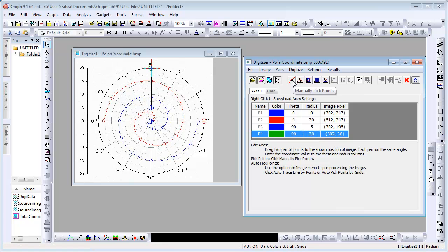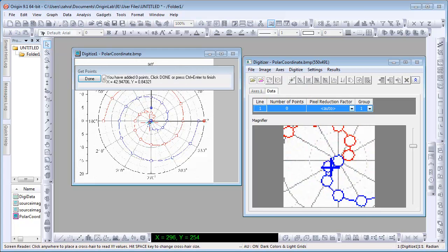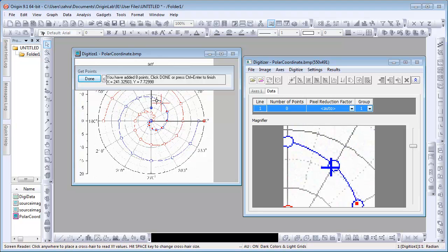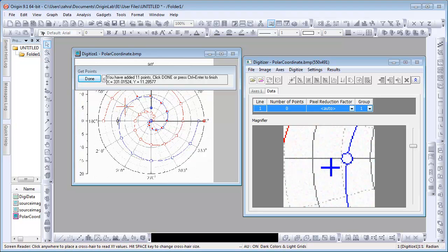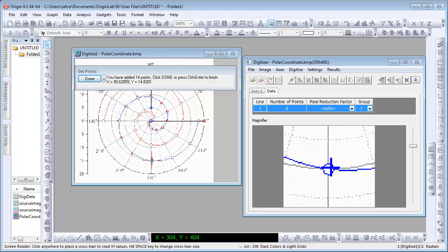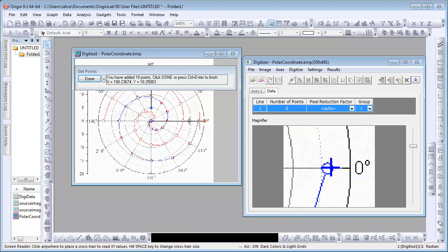Use the manually pick points method to quickly digitize one of the curves so that you can compare it with the original image.